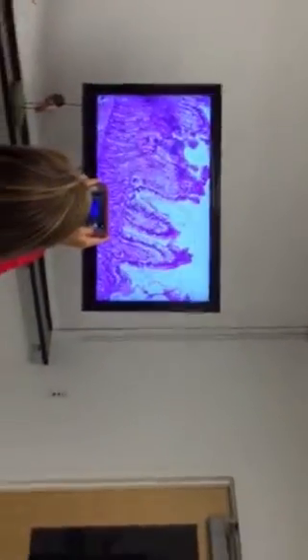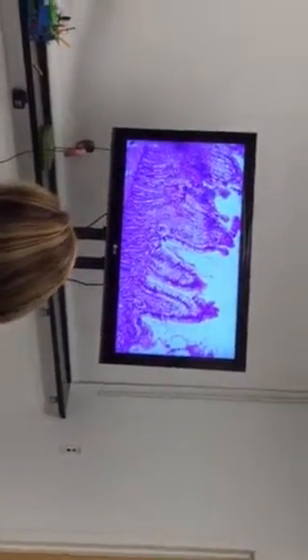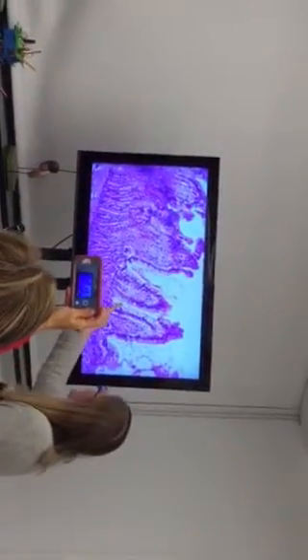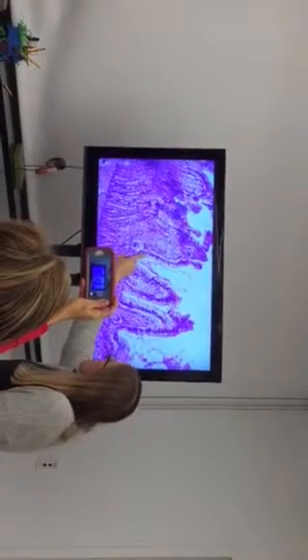The small intestine, right away, you'll notice the big waves, right? The finger-like projections. And so each finger-like projection is called a villus. So this is a villus. This is a villus. Each villus has a lining of simple columnar. And I'll show you. You can see it here better.